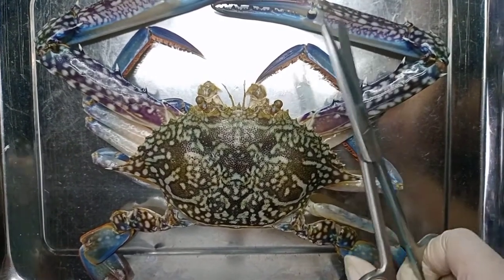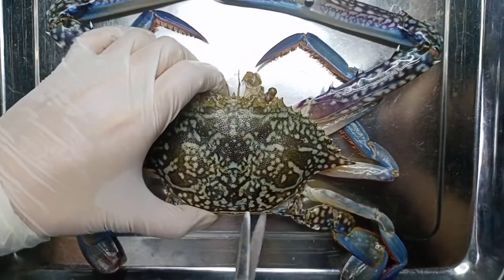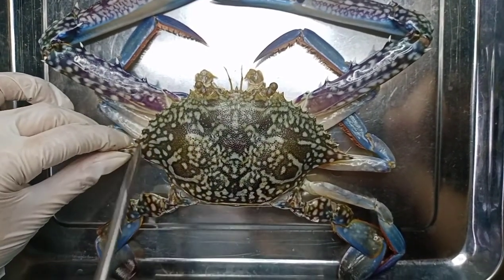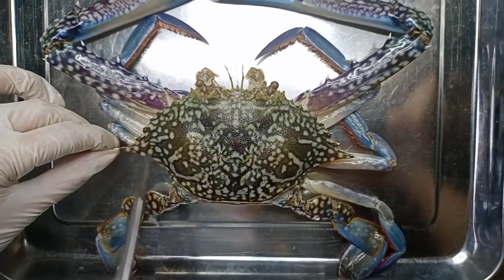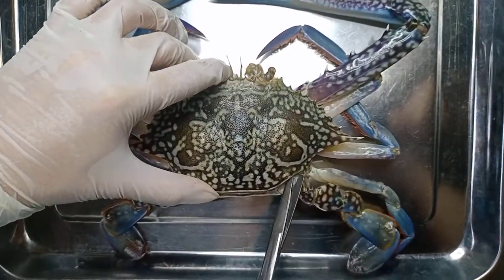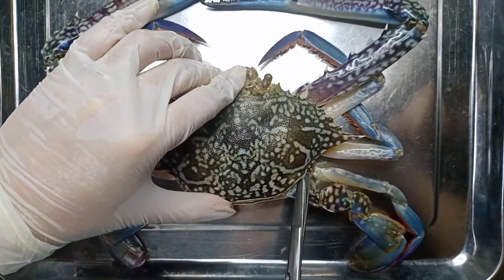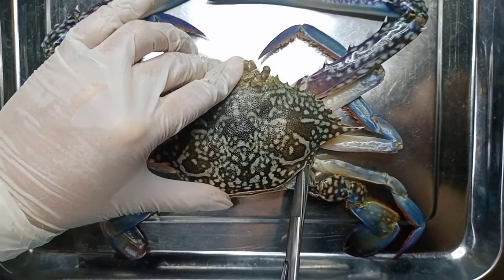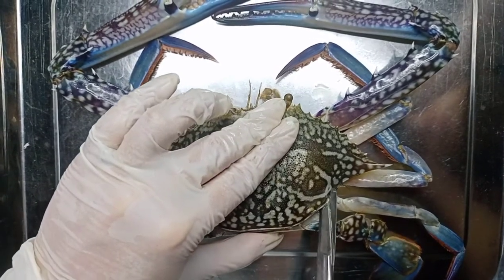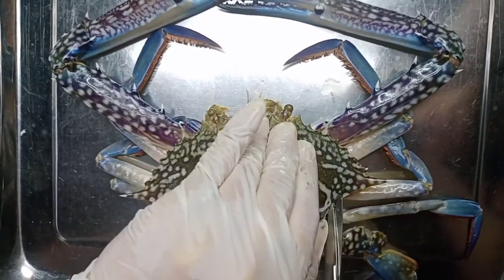Now let's get some scissors and start the dissection of the carapace. Let's start here, then go around the carapace, being careful to avoid damaging the internal organs of the crab.